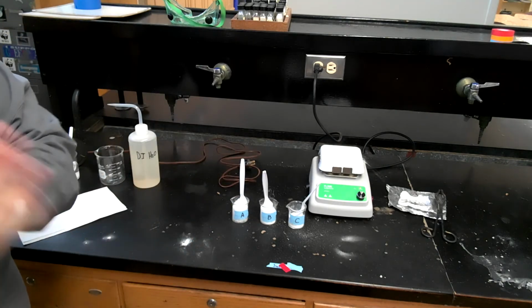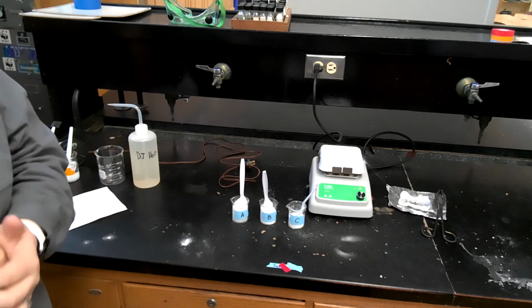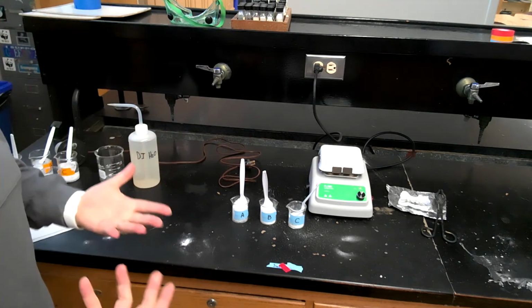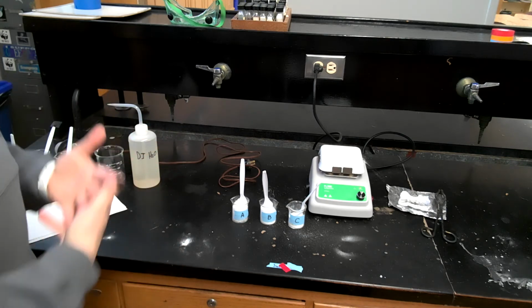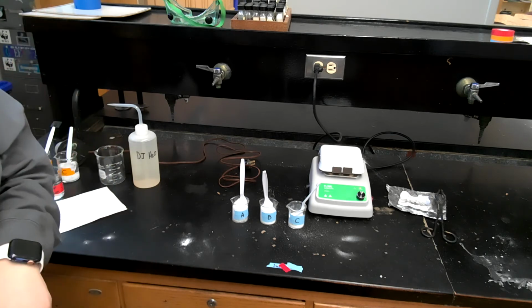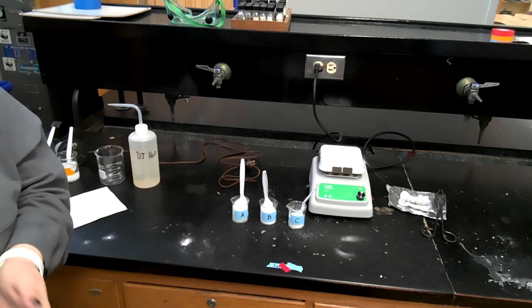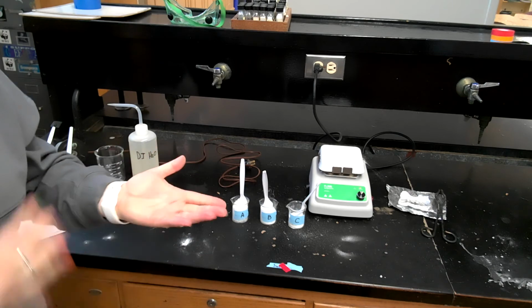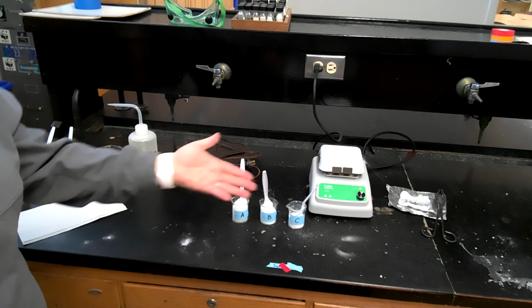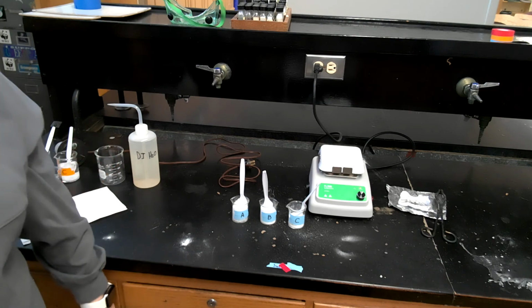So throughout the rest of this lab, we're going to take a look at some other tests to see and confirm which types of bonds we have here. So that's the general purpose of this lab, is determining the types of bonds and the types of substances we have here for these 3 unknown substances. So we're going to be relating if it's an ionic, covalent, or if it's non-polar or polar covalent as well. So throughout these tests and after analyzing our data, we should be able to determine not only the bond type, but also what substances we have here, and if it's paraffin wax, sodium bicarbonate, or fructose.